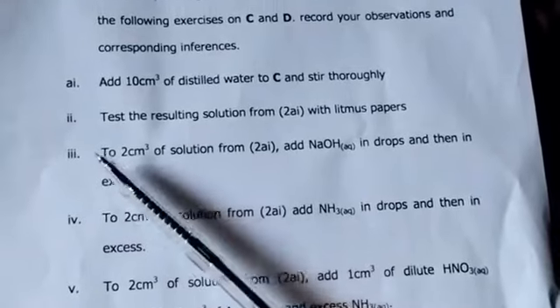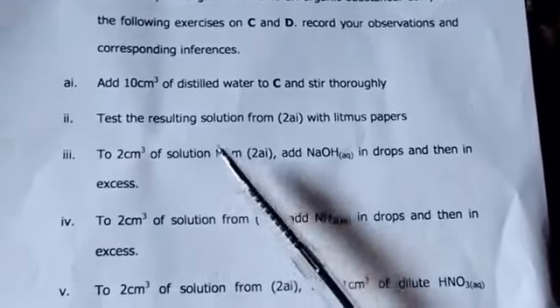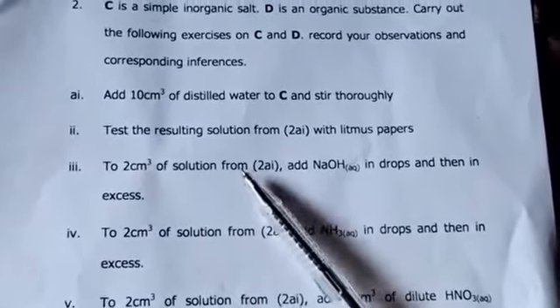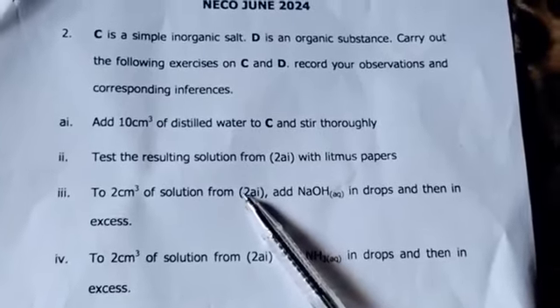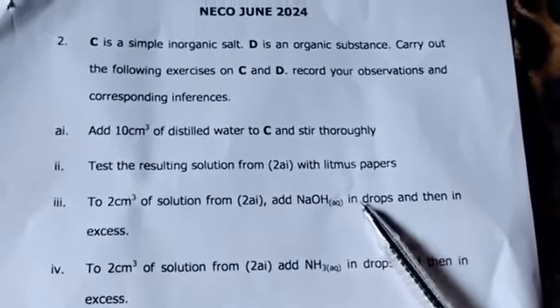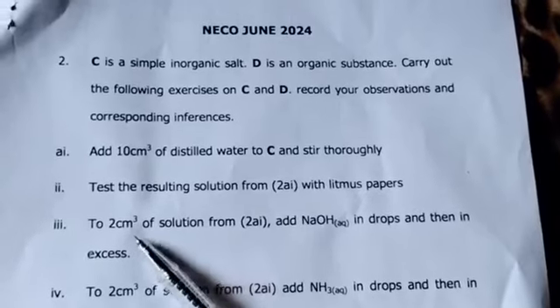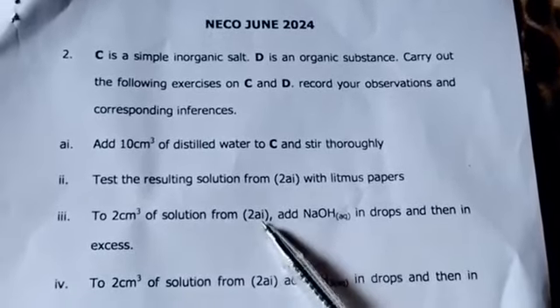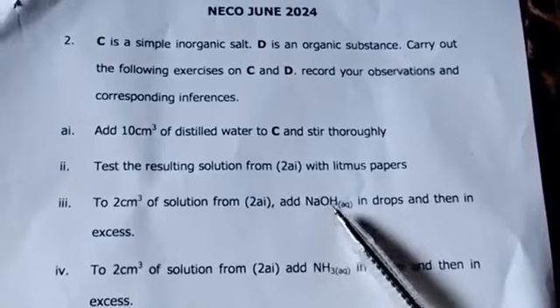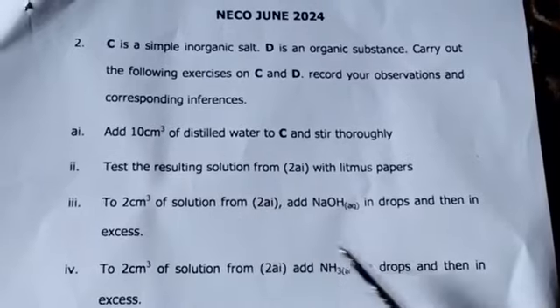When I go to question III, it says to 2 cm cube of solution from 2AI. The 2AI is the C plus water, remember? Add NaOH aqueous in drops and then in excess. To 2 cm cube of solution from 2AI, add NaOH aqueous in drops and then in excess. So let's go to the board.